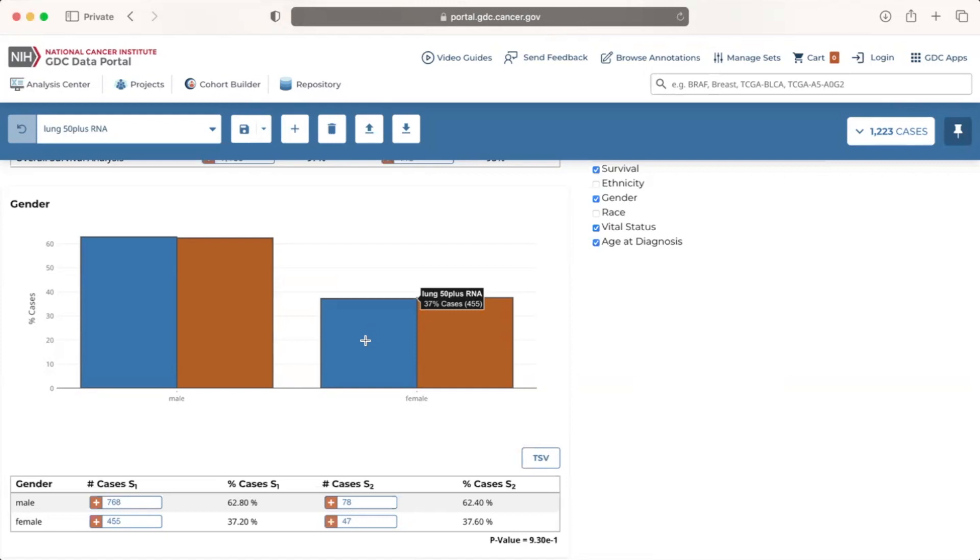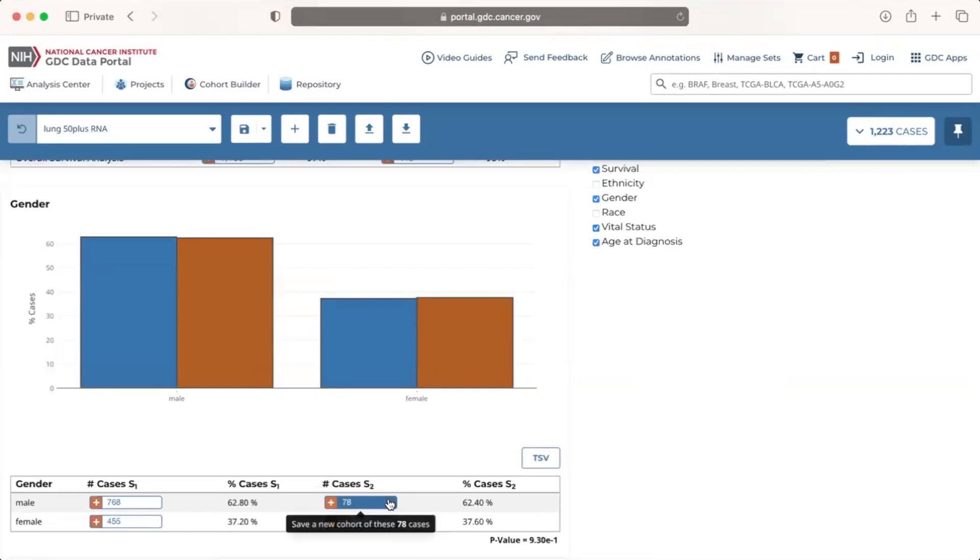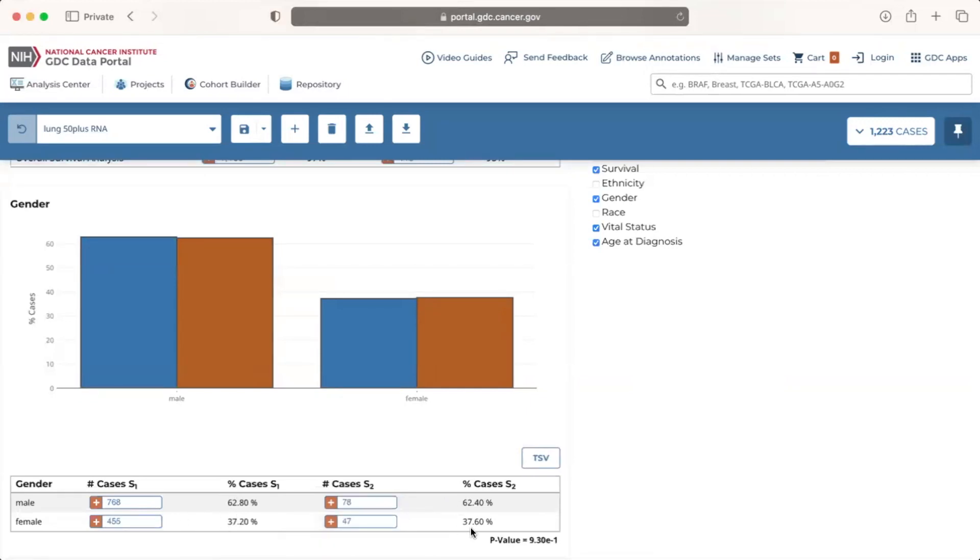Below the visual is a table presenting the same information, that is, number and percent of cases for each cohort and each category. A p-value also appears to the bottom right of each clinical facets table.